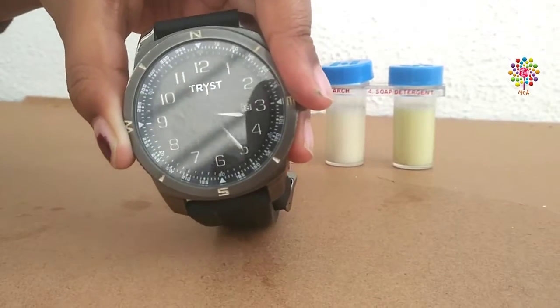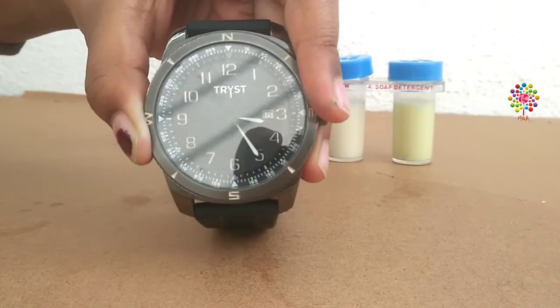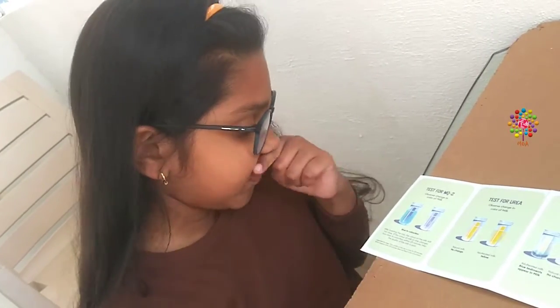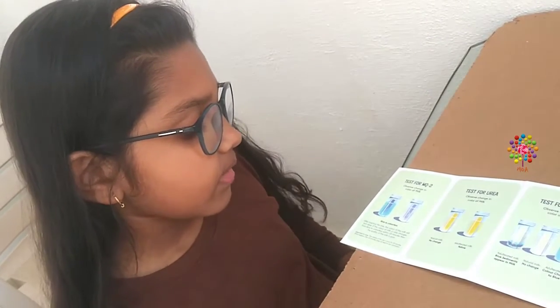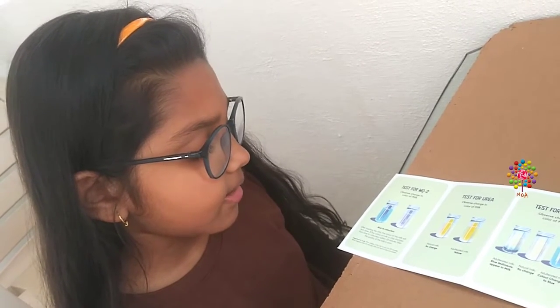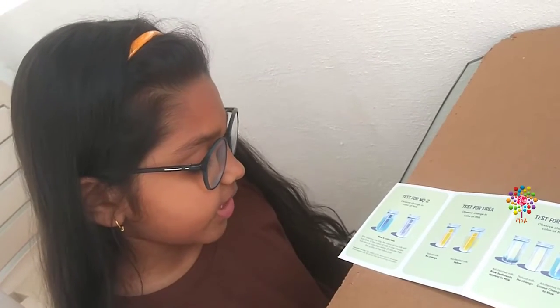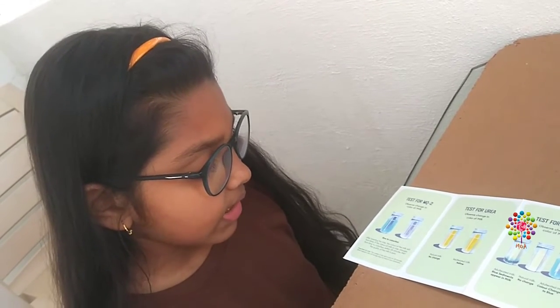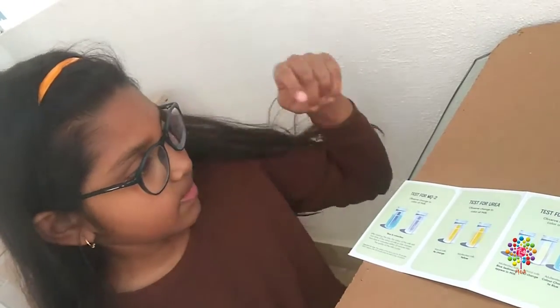We started the test at 3:25. I will show you after 25 minutes. Until then, I will explain all of them to you. Test for MQ2. Observe change in color of milk. Blue to colorless. After inserting the strip, the color of the milk will turn blue. If the color of the milk or strip changes from blue to colorless within 25 minutes, then the quality of the milk is poor. Let's check if our milk is blue.